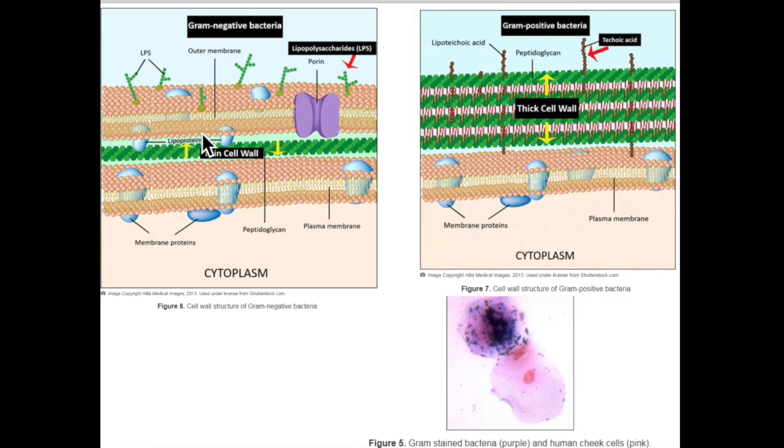Okay, so then you add water, as you do in the gram stain after every step, and then you add safranin, and safranin will go ahead and go through the peptidoglycan on both types of cells and stain them red. It's just, again, that the gram-positive cell also has a bunch of purple, and if you add red on that, it just makes it darker purple or kind of a reddish purple, whereas the gram-negative cell, if we look over here, the decolorization made all of the crystal violet iodine complex leave. So now when you add safranin, it loads up this area with safranin to give you a nice red or a nice pink coloring. And so that's what we believe is going on, at least to some degree, during the Gram stain, and why gram-positive bacteria are stained blue or purple, and gram-negative bacteria are stained red or pink.